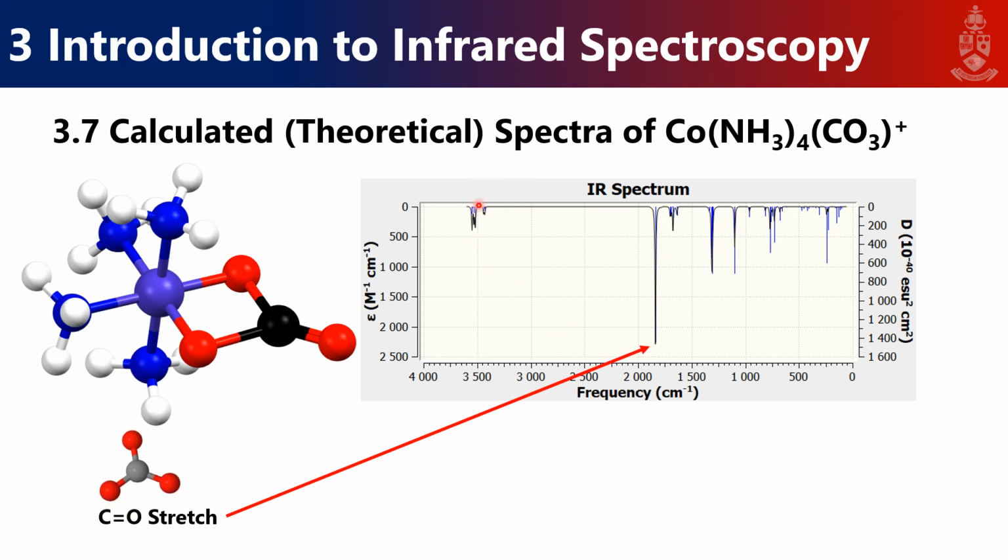But we still see our NH stretches, our NH bends, and once again our fingerprint region has changed because we're working with a different complex, right? And you can search up which peaks are the cobalt-oxygen and the cobalt-carbon-oxygen single bond stretches. Another word for fundamental is also, of course, characteristic. So the fundamental characteristic stretch is very unique to this structure, because it's the only one that contains a carbonyl. So you know how to look for that in your experimental spectrum.